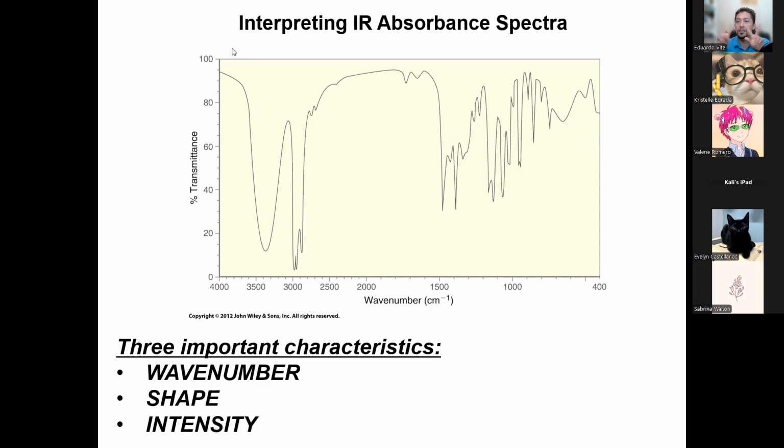So even though it would be the same conditions, like two carbon-oxygen bonds, the fact that they're in opposite directions, they can cancel each other out, or they can behave in such a way where they don't cancel each other out. Does that make sense? And I think it'll be more evident once we actually see the animation. So this is actually a good question to lead on to the next thing.